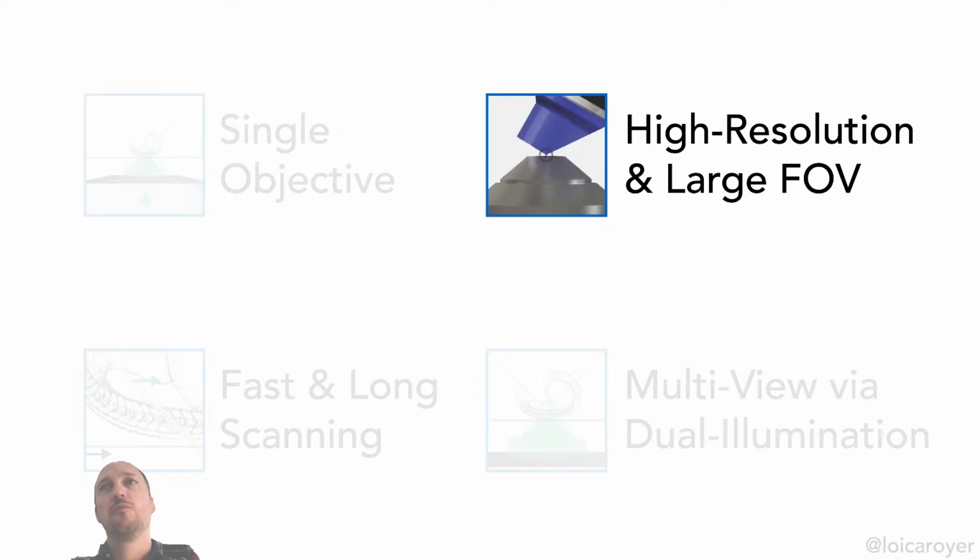So of course, ergonomics and being able to look at multiple embryos is important, but if you lose resolution, or if you cannot image the whole sample or all the parts of the sample you care about, then you're making a compromise. And what we wanted to do is not to have a zero-sum game, but really gain on all fronts simultaneously. So can we retain the high resolution and increase the field of view and the imaging volume? Can we do that?